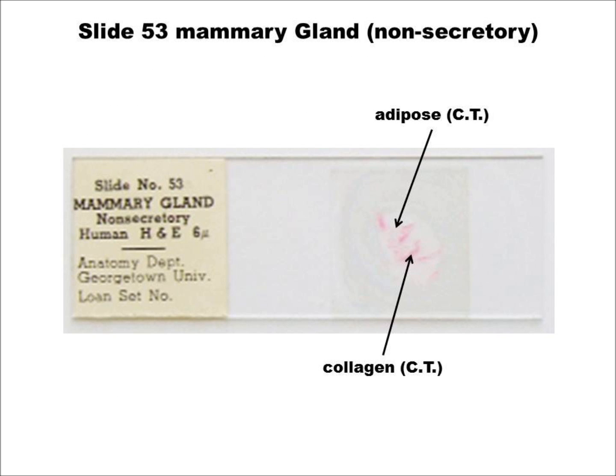Now, when you start out, there is a natural temptation to put the slide on the microscope and go directly to the 40x objective lens. Resist this temptation. I want you to go through the slides in the following fashion. First, place the slide on a white sheet of paper, as shown here, and just look at it. Determine the general layout of the tissue, the number of pieces, and the nature of the staining.